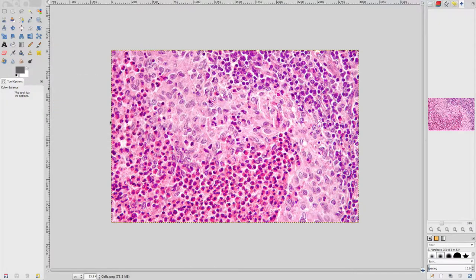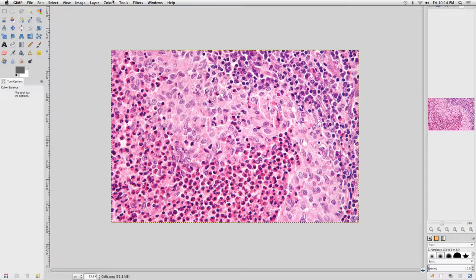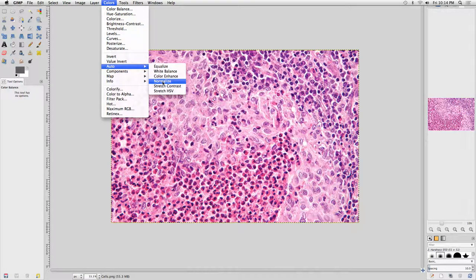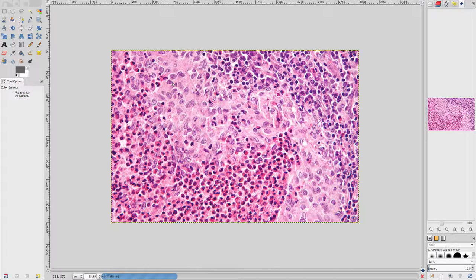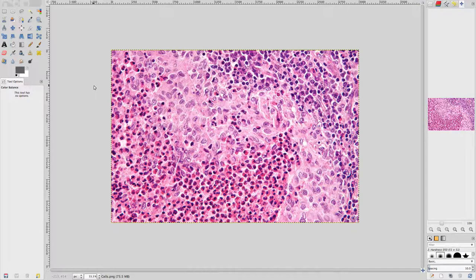Click the Cancel button to close the Color Balance window. GIMP also includes tools that will determine and apply certain color transforms automatically; again, these should only be used appropriately. To demonstrate one of these tools, go to the Colors menu, select Auto, then Normalize. Normalize transforms intensity values in the image so that the darkest point becomes black and the brightest point becomes as bright as possible without altering its hue. Since this image is already well balanced, there is only a subtle transform when normalized.